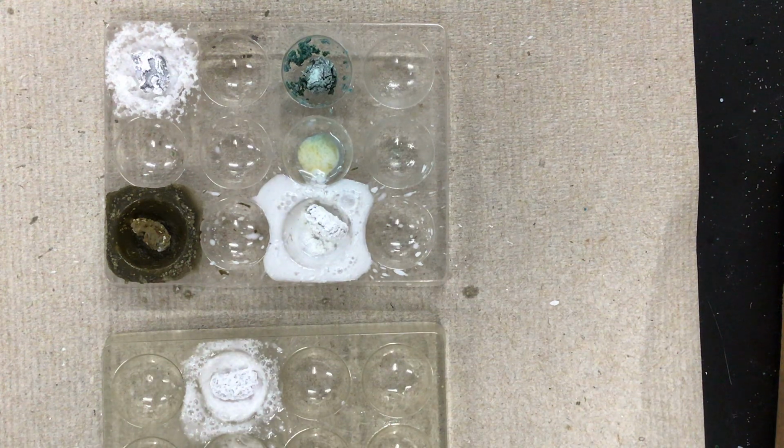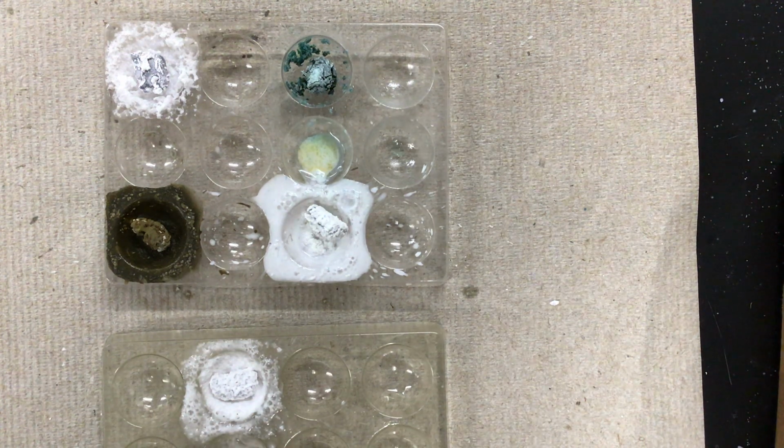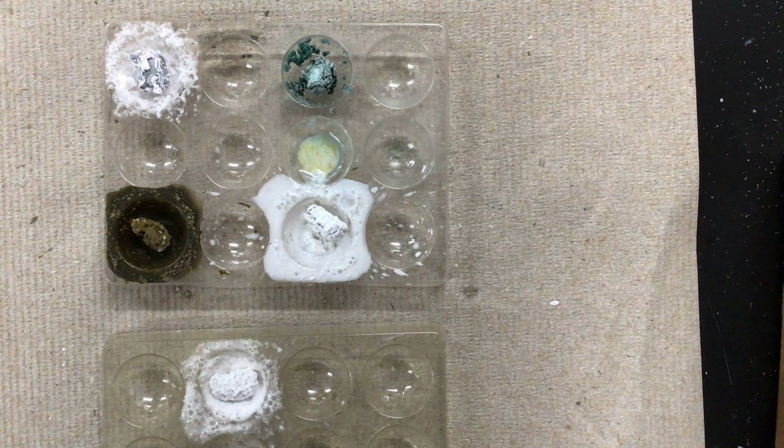So you can see that calcium was definitely the most reactive out of the ones that we've tested so far. You have a lot of physical evidence to support that. All of them were exothermic. All of them had little explosions. All of them produced a gas. So there was a lot of evidence that a chemical reaction took place there. So make sure that you record that in your notes and then join me for the reactions of magnesium.